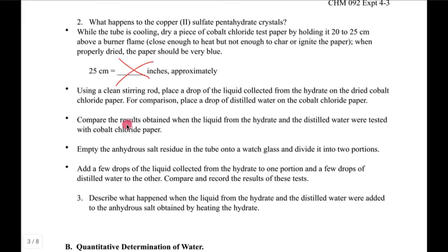I will mention this a little bit because I didn't do a full intro to it in the video. Basically, it's a little piece of paper, this blue. It's a test strip, and all it is is a test strip for water. When water is the sample that you're testing, the test strip will turn from blue to pink. It's a classic kind of color change to indicate that the sample you have in front of you is water.